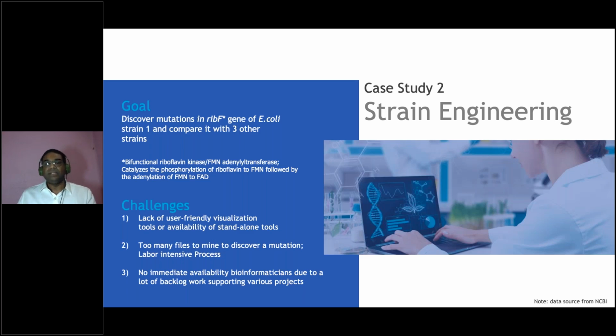But even if the scientists settle for command line based querying and mining of the data with the help of a bioinformatician, their availability is another big challenge, because bioinformaticians are busy supporting multiple other projects in the R&D team. So those are the challenges you have to overcome to do this kind of work.